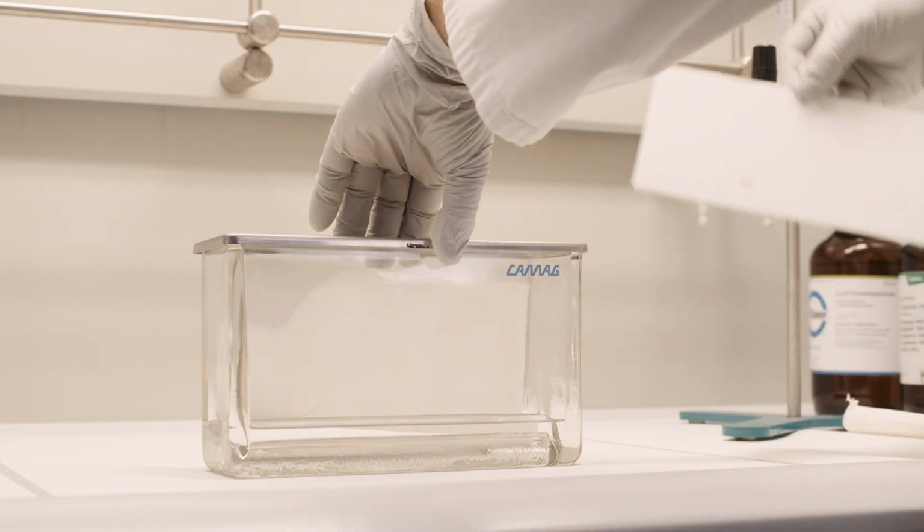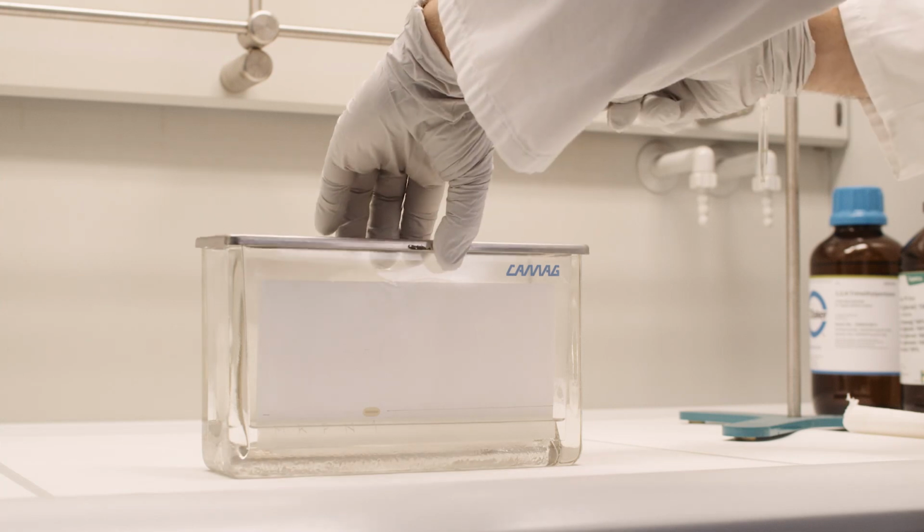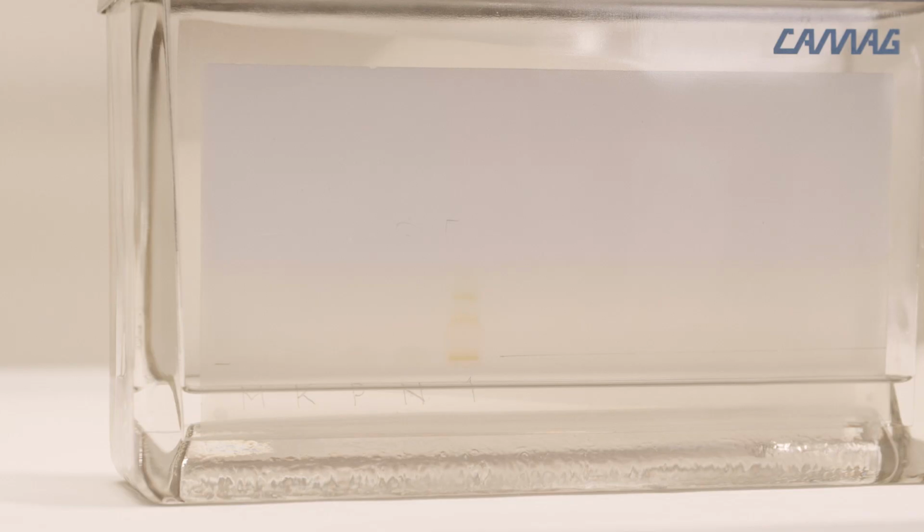Along the edge, use a pencil to mark the line of application. The plate is developed immersed in the mobile phase in special developing tanks with a lid. In doing so, we take care that the mobile phase level stays below the starting line. The tank also contains a piece of filter paper that is soaked with the mobile phase and ensures that the atmosphere in the tank is saturated.